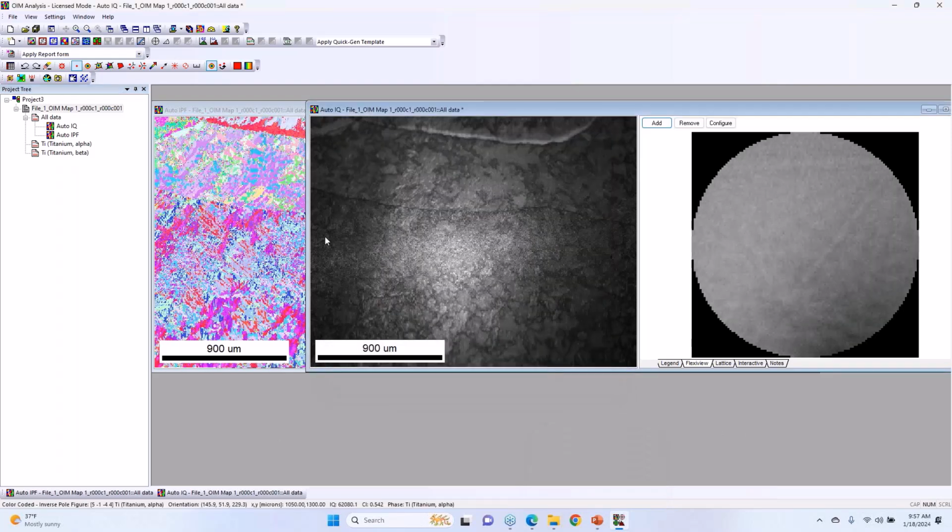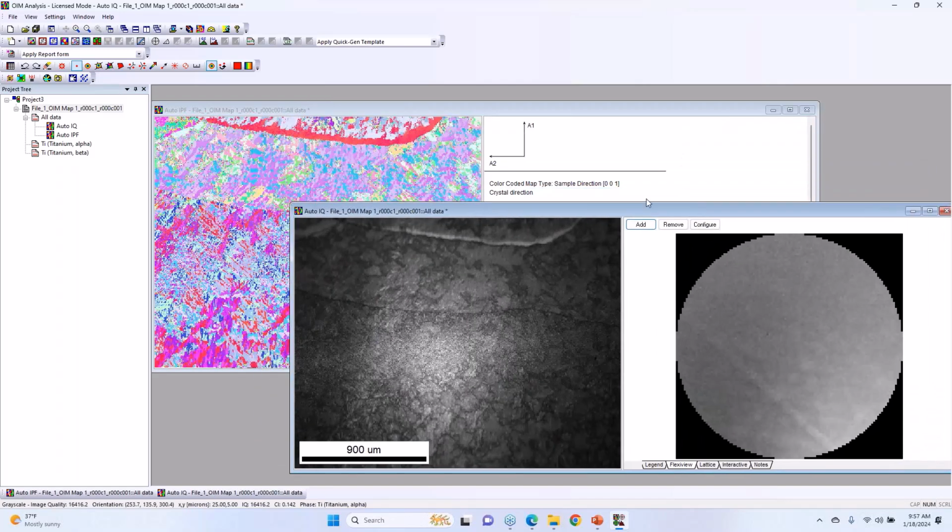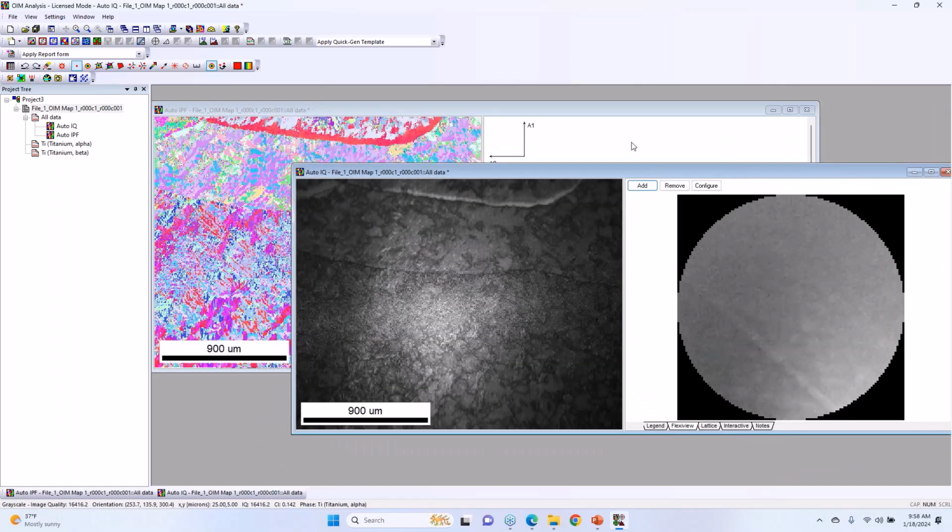So you can start to think about centimeter scale resolutions on large scale microstructures. And with the modern cameras that are fast, you can still do that with sufficient spatial resolution to characterize things.